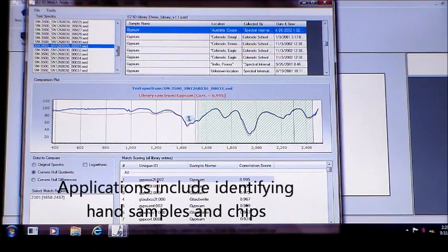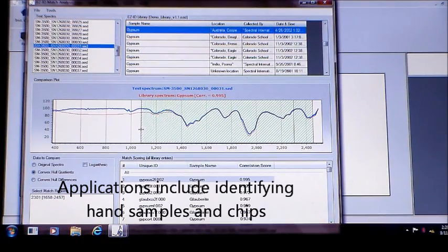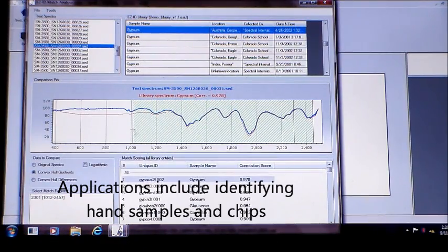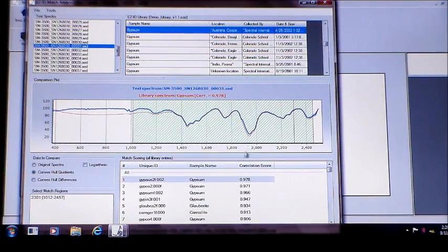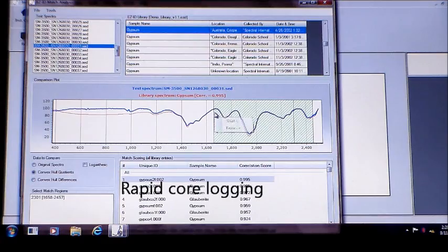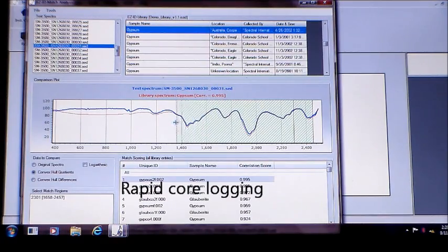In addition to being a great tool for identifying hand samples and chips, EZID allows you to rapidly identify cores in a core logging application.